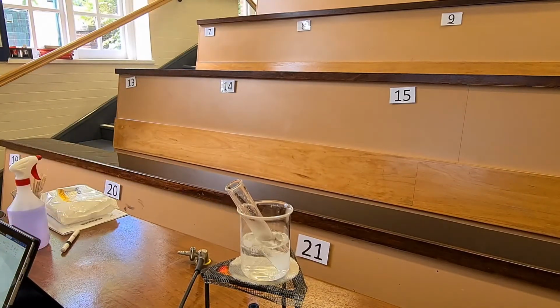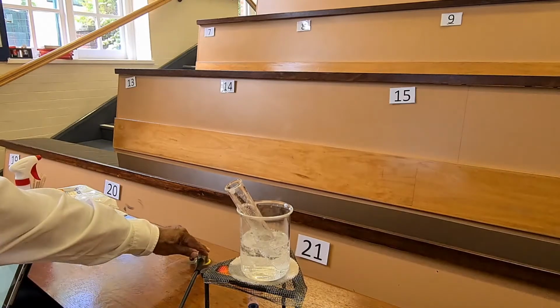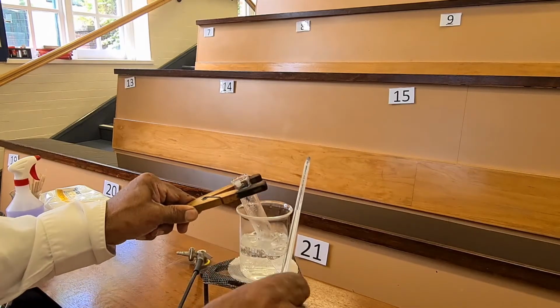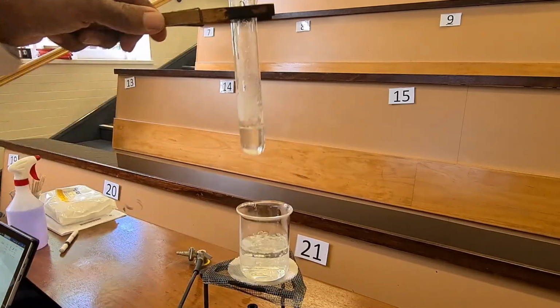So I put it back in to get the water hotter. Now that water there is boiling. Can't get it hotter than boiling water. So I'm going to turn the Bunsen off. I think that should be hot enough for it to dissolve. Let's try again.